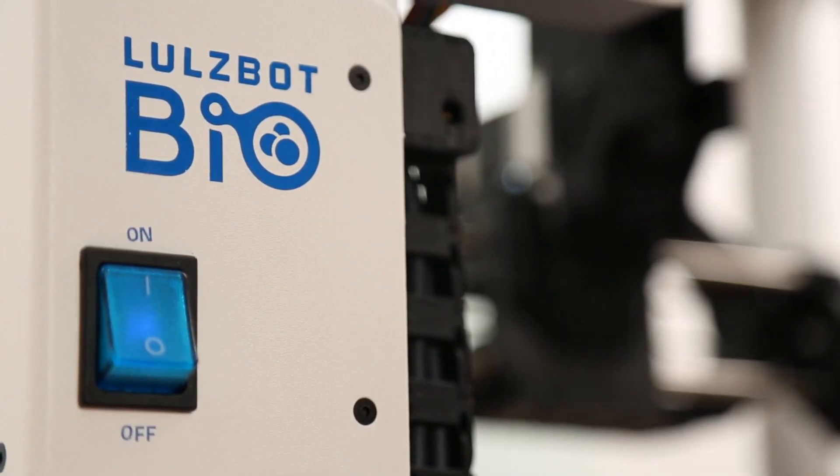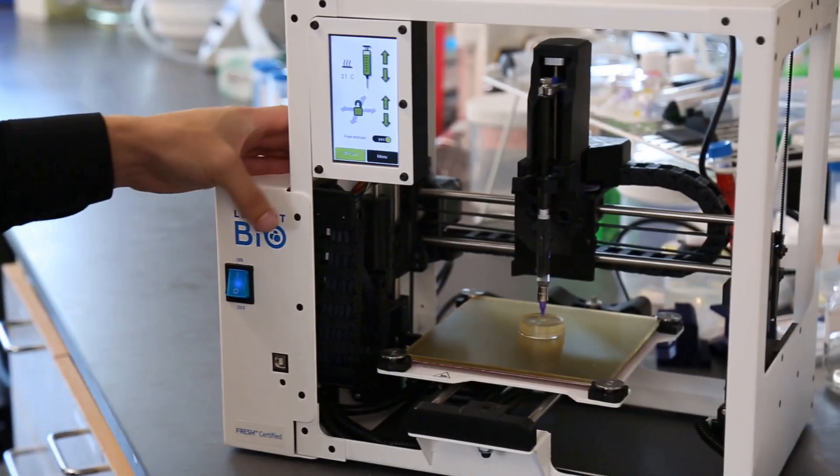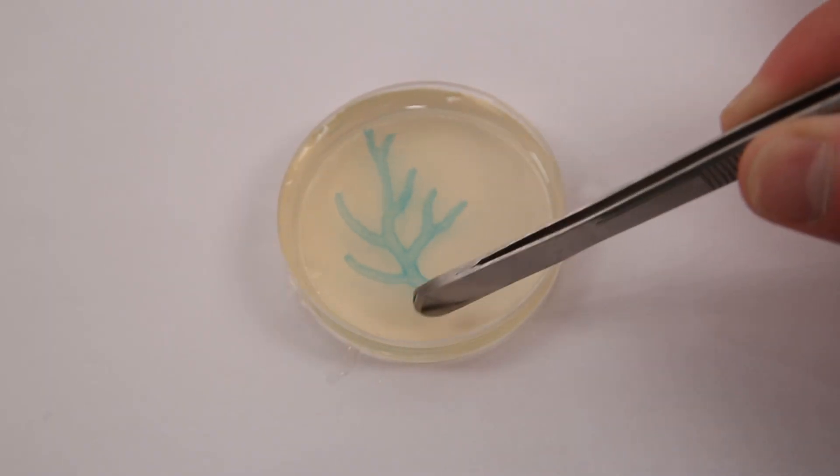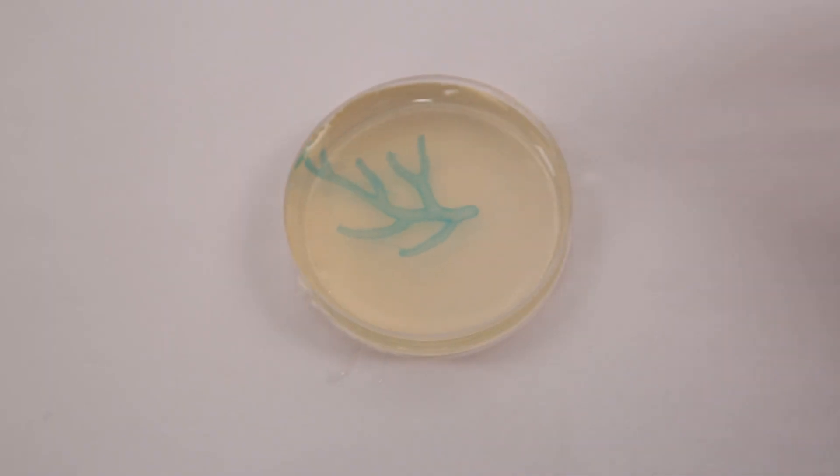The Lulzbot Bio is a fresh certified bioprinter ready for use with bio inks, unmodified collagen, and other soft materials for pharmaceutical and cosmetic testing, regenerative medicine, and tissue engineering.